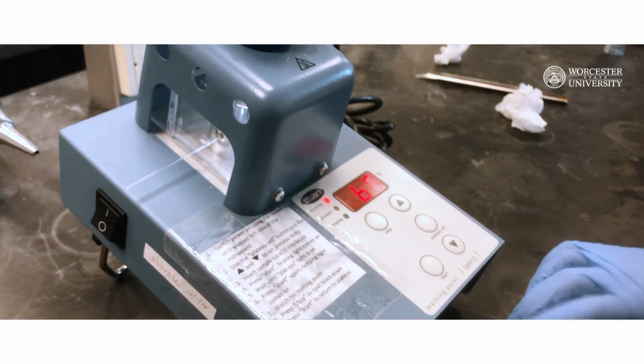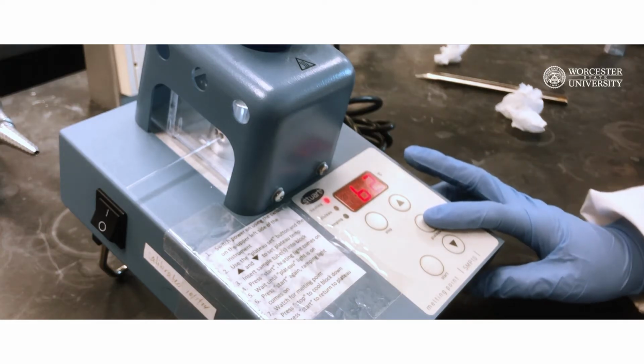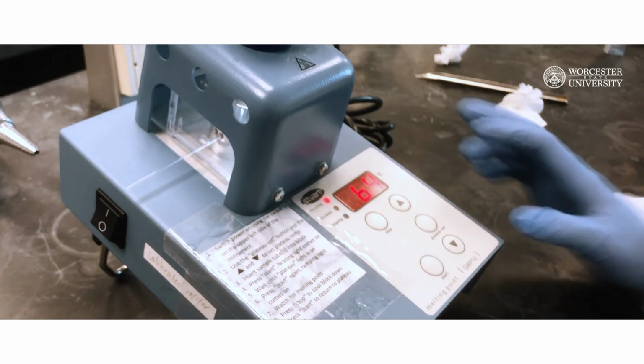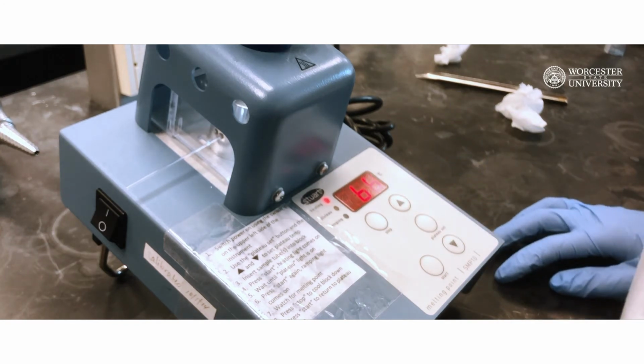If you need to recheck the plateau temperature during operation, you can do so by simply pressing and holding the plateau set button. This action will not interfere with the operation of the apparatus.